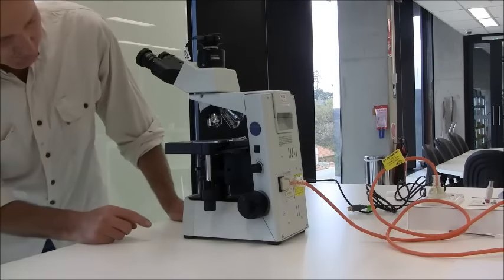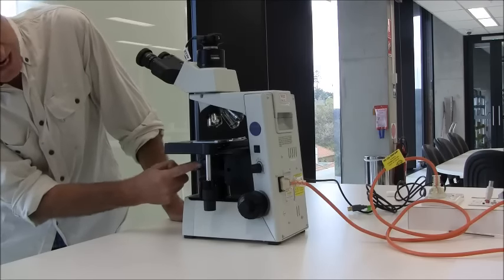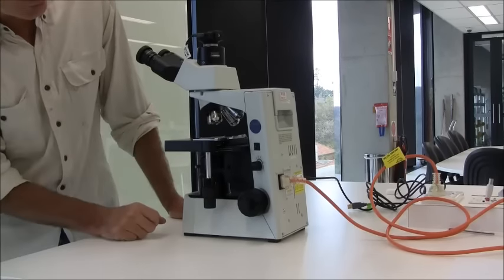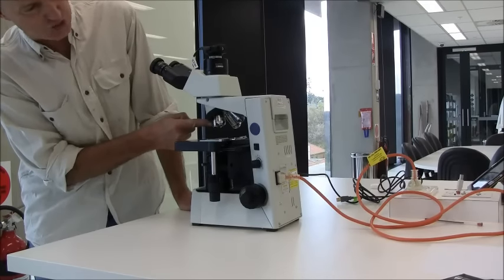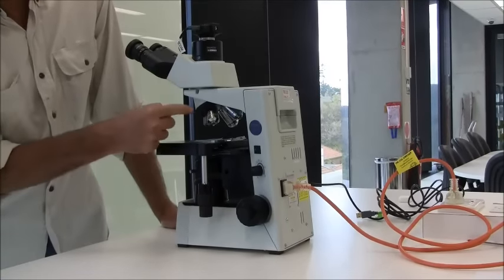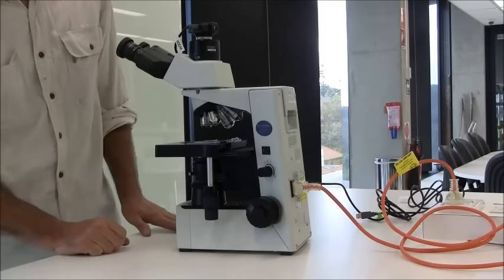And generally how they work is light from a light source is passed through a series of lenses that focuses the light on a specimen, which is clamped on a stage. The image is then passed through the objective lens and then up through the eyepiece lens and into your eye. So that's the path of the light. The parts of the microscope, quickly.